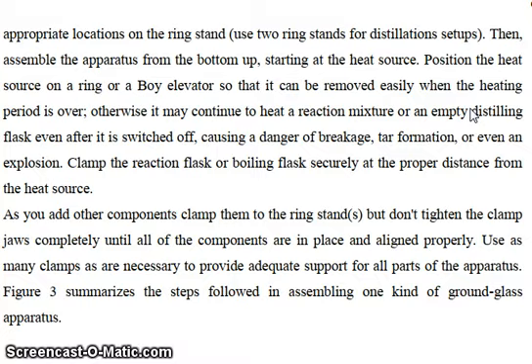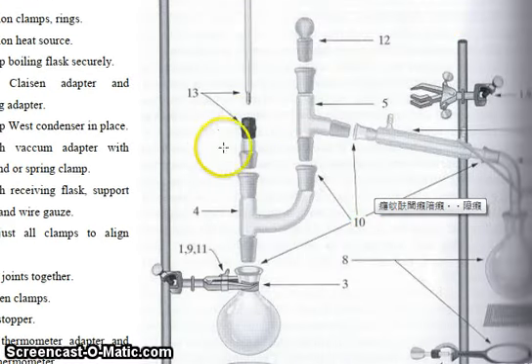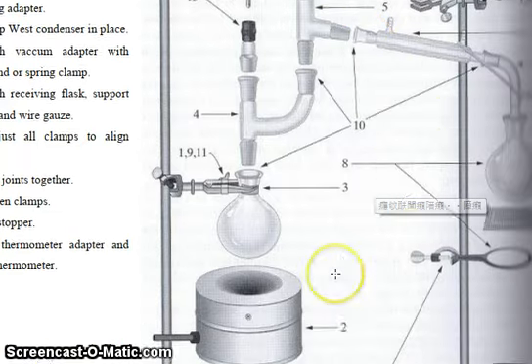You can see the assembling here. You see how it is clamping, this portion, this portion, this portion. Always put the grease here. You can see here, this portion, this portion.